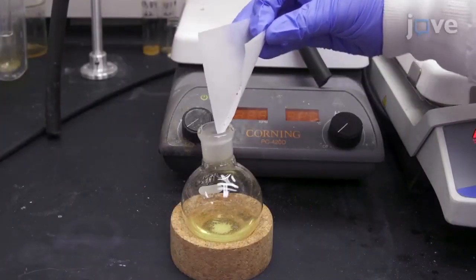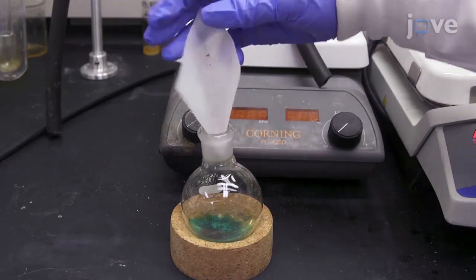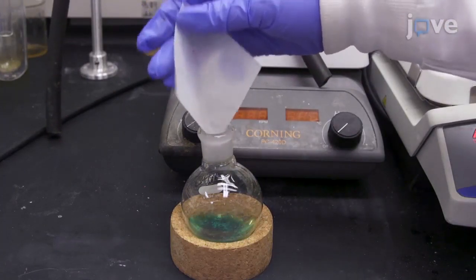The reaction should change from a light yellow color to emerald green immediately after the cobalt(II) chloride hexahydrate is added.